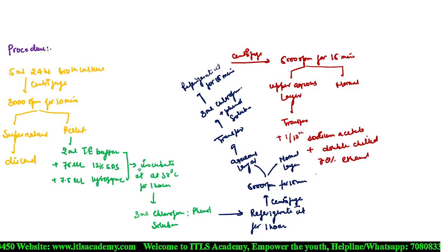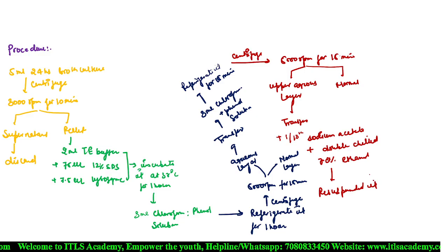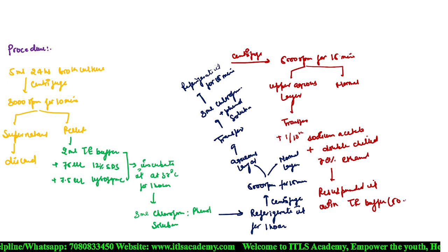and you have to resuspend it with the TE buffer, around 50 to 60 microliter, and refrigerate it.